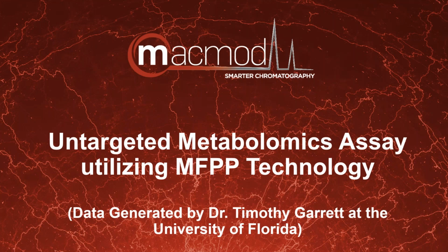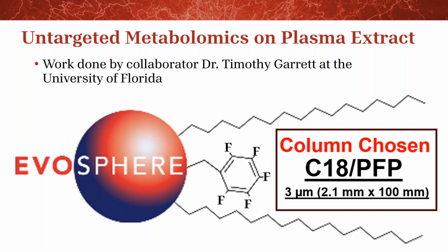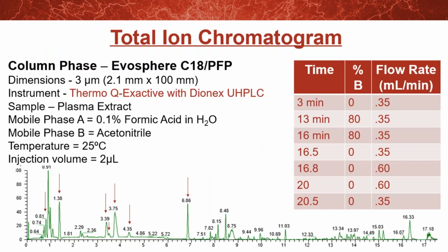So we partnered with a collaborator at the University of Florida, Dr. Tim Garrett, and he's used the C18 PFP for a while now for untargeted metabolomics methods. So here's the total ion chromatogram, and we focus in on the arrows that are sort of the unique benefits of the column.